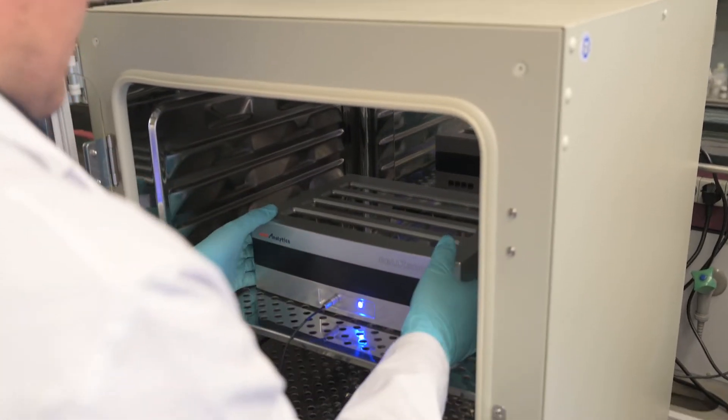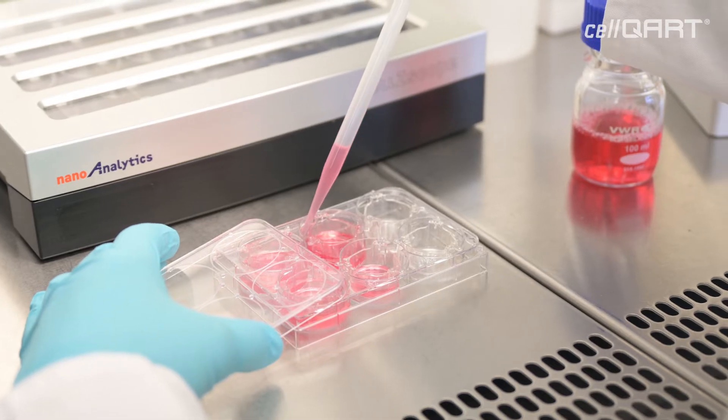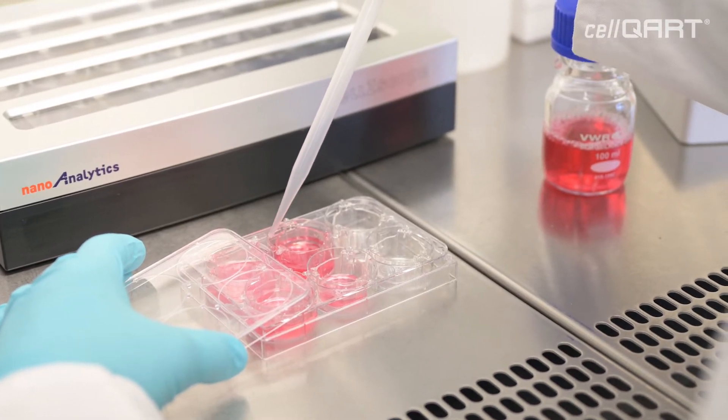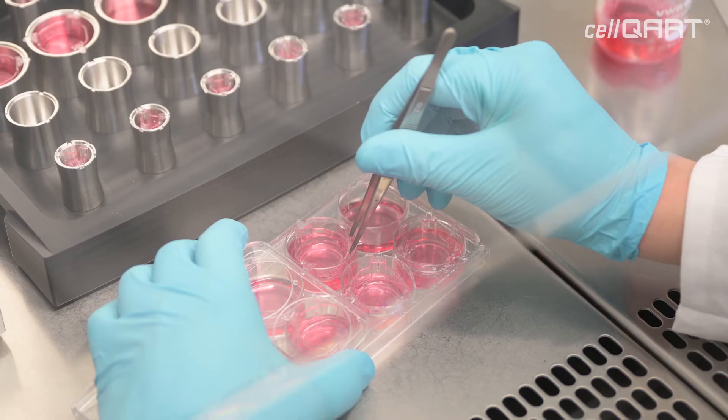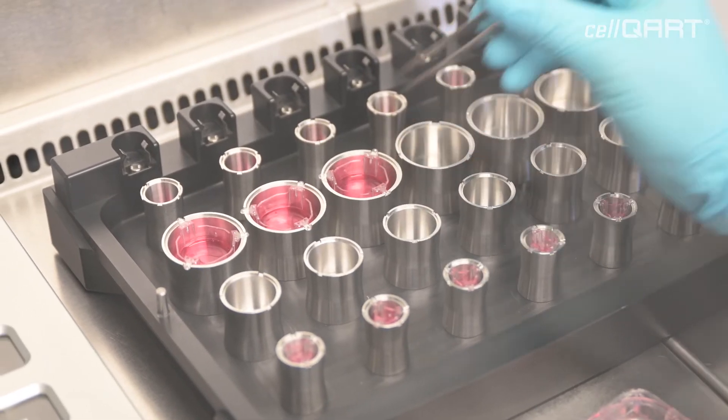The CellScope device and the CellCard inserts have been harmonized, so the CellCard inserts fit perfectly well into the CellScope module and they provide a very convenient way of doing these kind of experiments. There are two top-notch products and they go very well together. So we got interested into these products, we use them and we use them ever since.